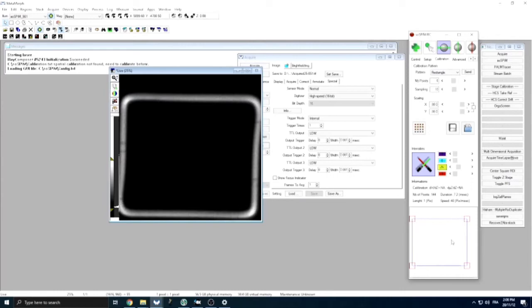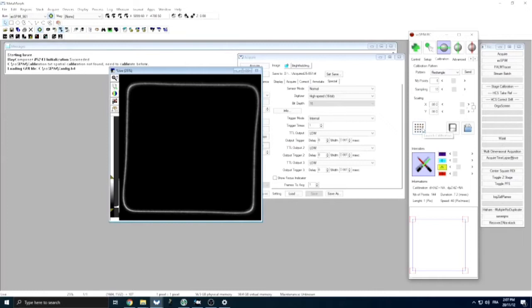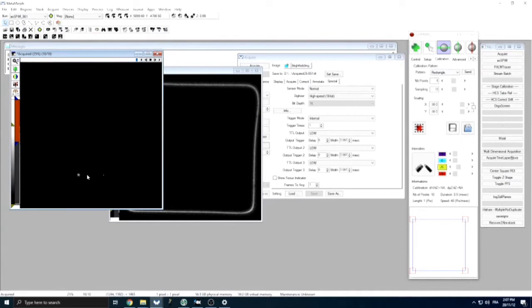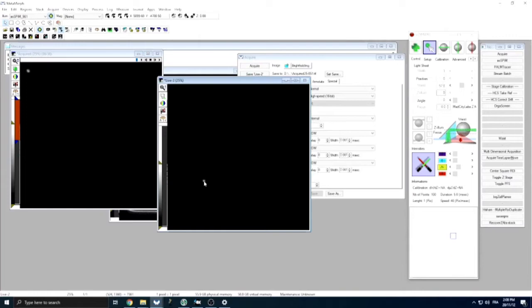We can directly displace and adjust the size of the rectangle in the SOSPIN plugin. We then start the calibration process: the laser beam is scanned within this rectangle, and for each galvanometric mirror position, the spot is detected and localized in the camera space. This enables us to compute the relationship between the galvanometric mirror and the camera space. Finally, we can check the validity of the calibration: the laser beam should be positioned at the correct positions in the camera field of view.